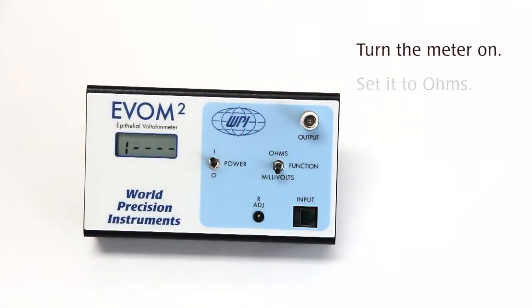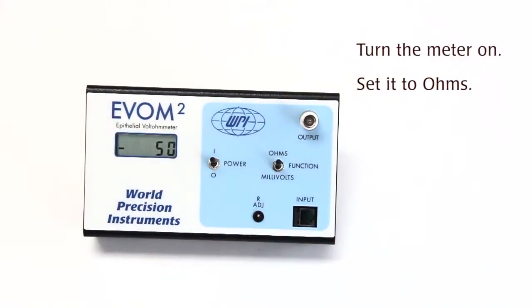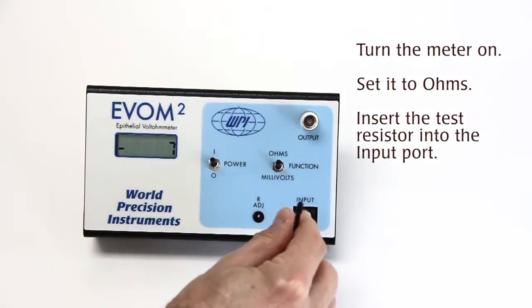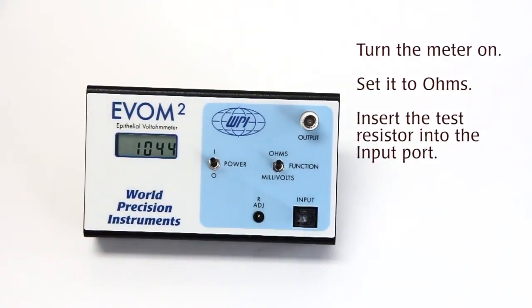Turn the unit on, make sure that the unit is in ohms since we're doing a resistance calibration. Take your test resistor and plug it into the place where the electrode would normally go. We know that the test resistor is 1000 ohms, but in this instance we're seeing that we're getting a measurement of 1050.